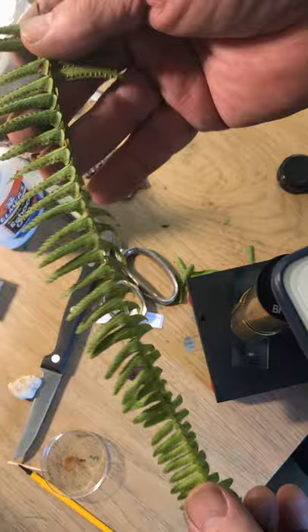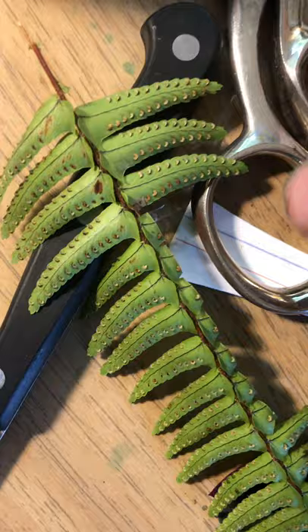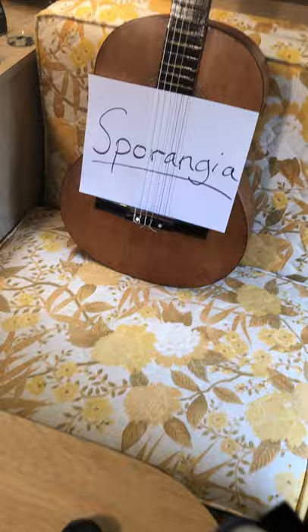...pretty much the oldest thing on the planet that's green. These are spores. Can you focus in on those right there? This is how you can tell you have a mature fern leaf — all those little brown capsulations on there, those are the sporangia. I've taken those off; let me show you how I did that.